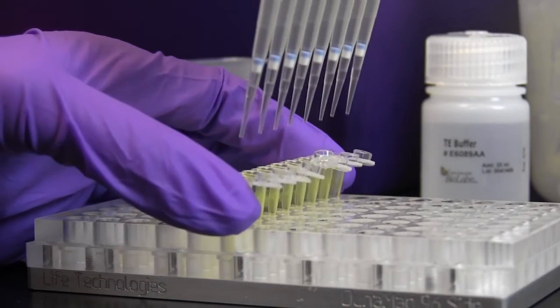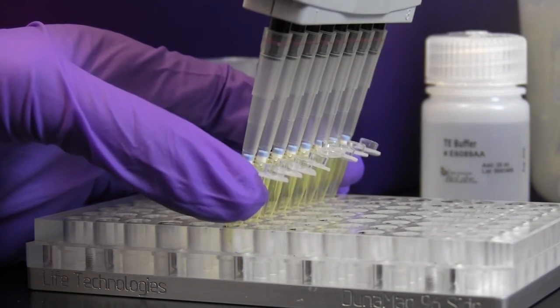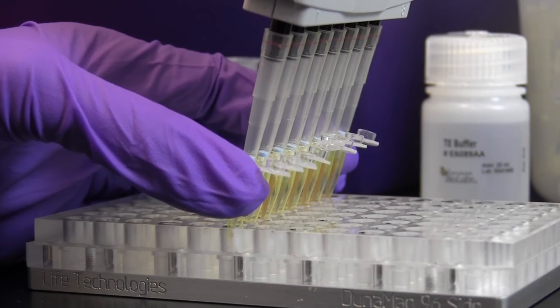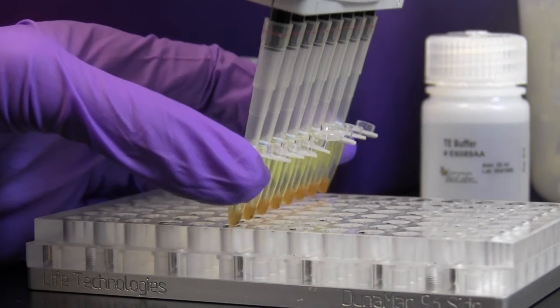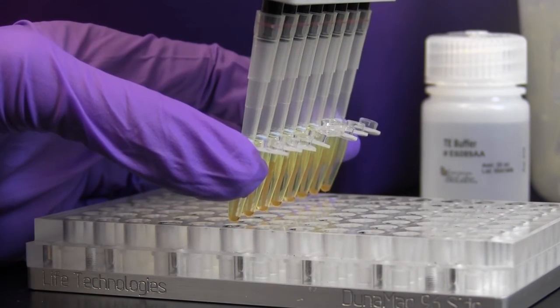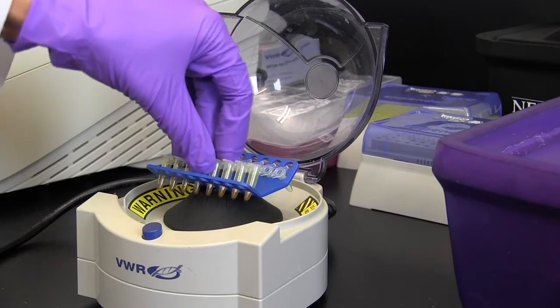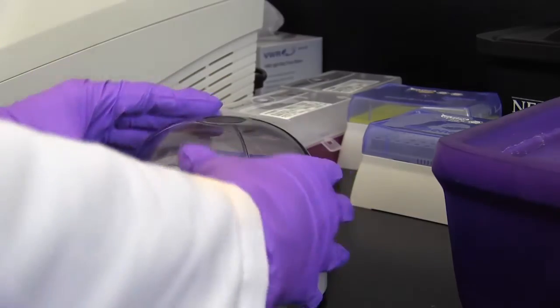Remove the tube or plate containing the dried bead pellet from the magnet and elute the library from the beads by adding 33 microliters of 0.1X TE buffer, followed by mixing well. After a quick spin, incubate at room temperature for 2 minutes.